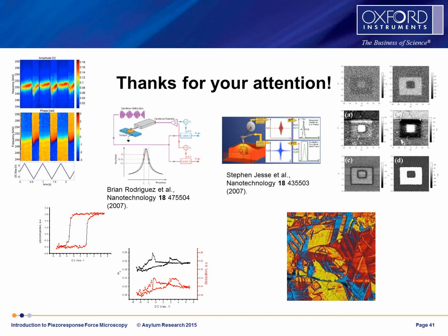For materials which are purely piezoelectric, we can basically observe things like piezoelectric domains, which in this case would be simply regions with a dissimilar crystallographic orientation. And in some cases we can study surface terminations. For example, there was a set of work done by Alexei and Brian Rodriguez when they observed materials like gallium nitride, which are piezoelectric, and in this case, if the surface is gallium terminated, it has one polarity, if it is nitrogen terminated, it has another polarity. So it's possible to study surface terminations and crystallographic orientations.